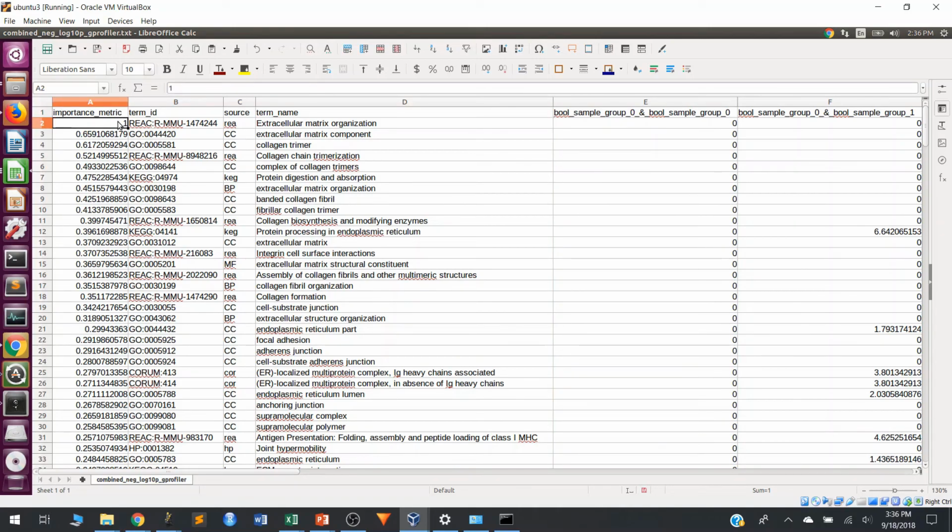So this is again based off of information theory and entropy, more specifically KL divergence. If you don't know what that means, not important. Basically, the higher it ranks, the more interesting this pathway might be for you. Meaning that it's highly enriched in one autocrine or paracrine interaction between different cell types, and it's very not enriched in all of the other ones.